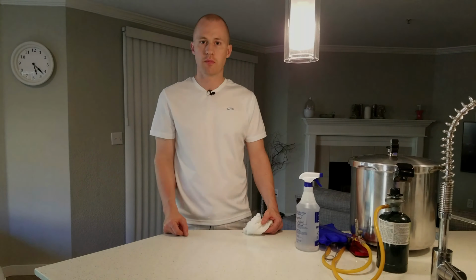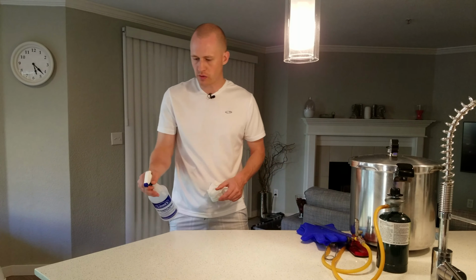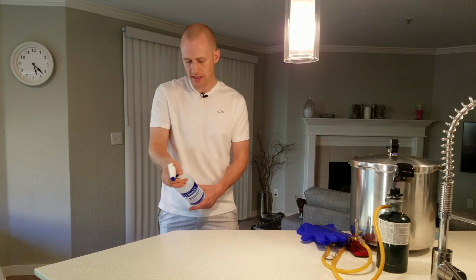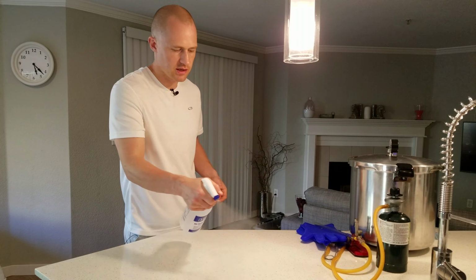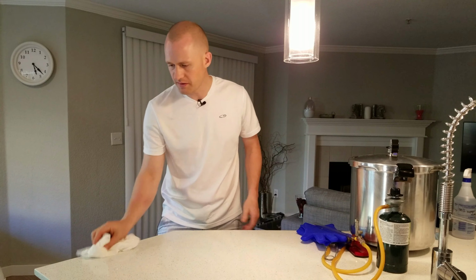Okay, we're now back for part 2. First thing we're going to do is to just spray down our work surface. Clean it up. I have a 70% isopropyl alcohol that I use. And then wipe it down.